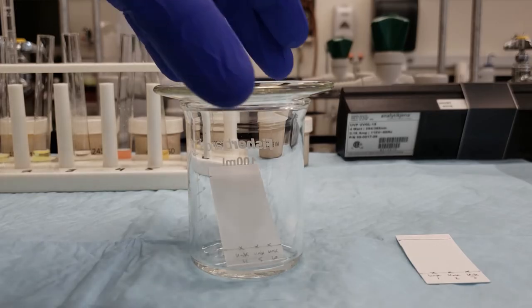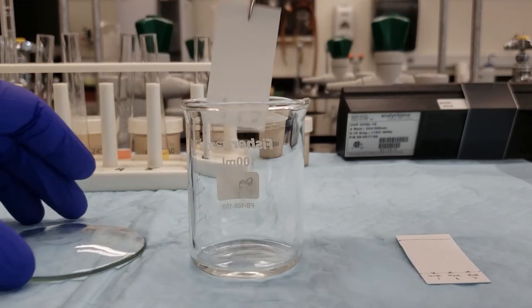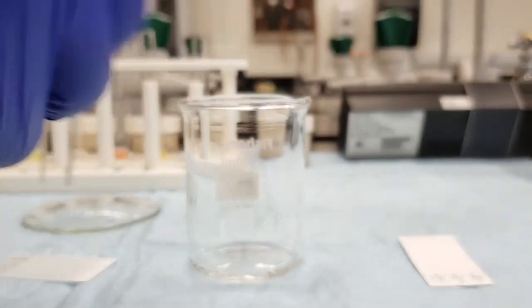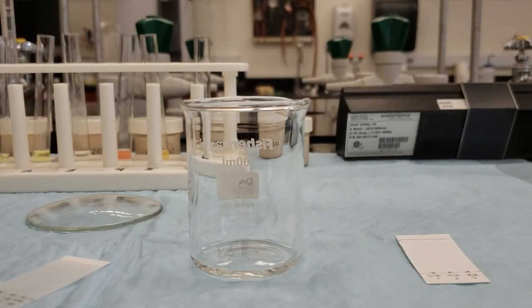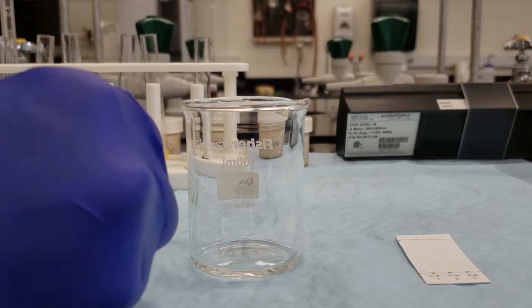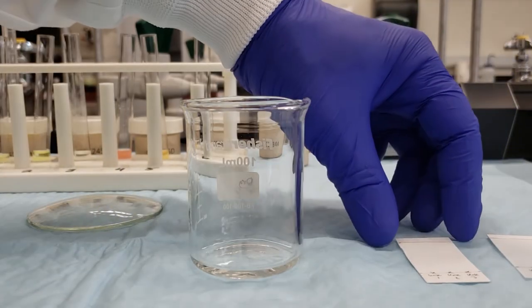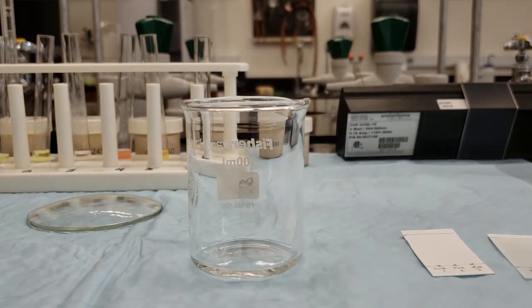Our second plate of unknowns is now finished developing. We'll go ahead and take it out, mark the line, and allow it to dry. While that's drying, we'll go ahead and take a look at our first plate of unknowns under the UV light.